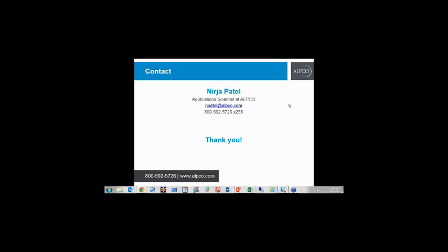If you're doing flow cytometry, just analytical work, you could certainly stain with these reagents, go through a washing procedure afterwards, and then fix with a FACS fixative, which is usually paraformaldehyde at 2%. They can be fixed with paraformaldehyde after staining, but I would not recommend fixation before staining. We haven't validated that.